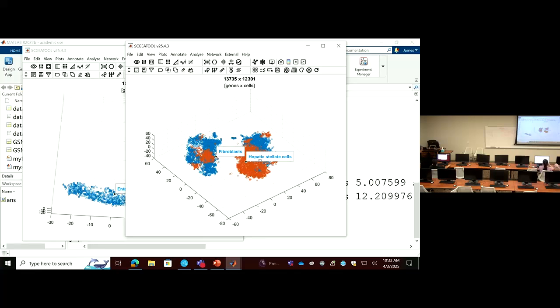When I sorted the batch ID, it doesn't come off, and mine doesn't look as distinct as yours. But these are the. Yeah. Should I select both? You don't have to select. You already have. Okay. Yeah. So this the cell type. What cell type is this? Enterocytes.